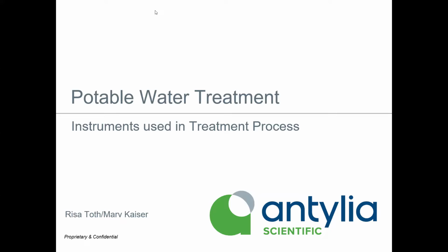Thanks, Paula. I appreciate that. As you mentioned, I'm Marv Kaiser, Global Product Manager of Electrochemistry at Antylia Scientific. Thank you for attending today's webinar. I'd like to cover a short overview of the potable water treatment process, some key instruments used in the treatment process, and where and why these instruments are used at certain stages of the treatment process.